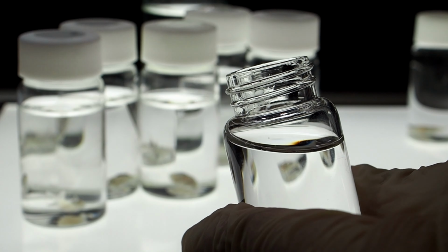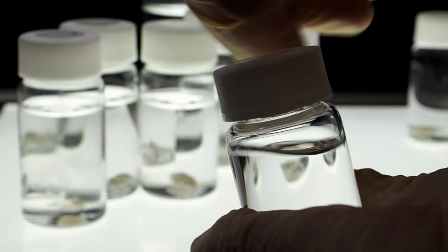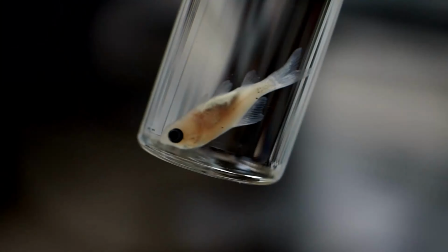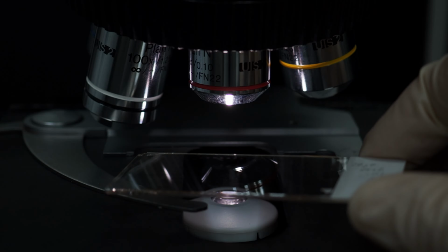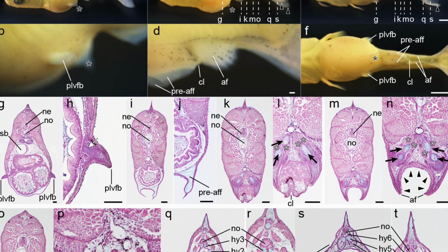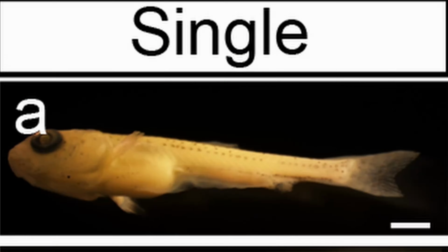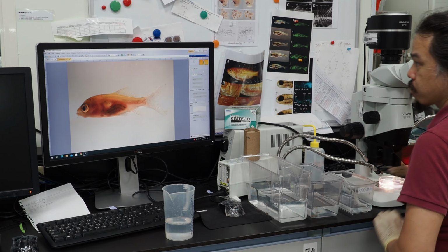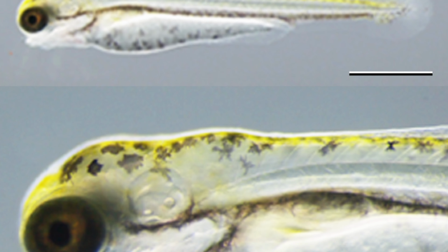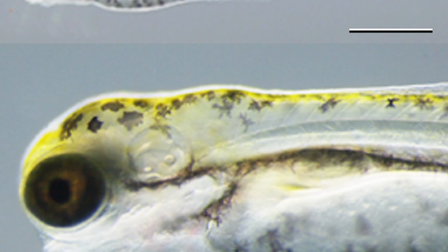The fixative method allows for repeated observation of the same fixed specimen and enables multiple photographs. Tissue sections can also be made and stained for microscopic observation, allowing detailed examination at the cellular level. Transparent specimens can be prepared to observe skeletal growth. In other words, detailed information can be obtained from a single specimen at the cellular and tissue levels. However, if detailed cellular observations are not necessary, photographing the live fish and keeping growth records is a good method.